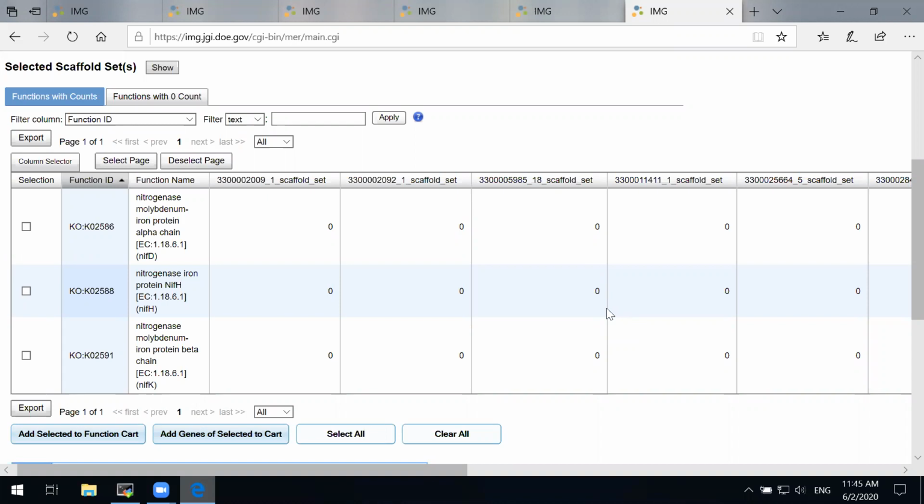It is using first the oligonucleotide composition of these contigs, because it is well established that, for multiple reasons, the oligonucleotide composition of the genome is relatively consistent. The second parameter that metagenome binning is using is read depth, or the coverage of these contigs. Again, the contigs that are coming from the same genome are expected to have approximately the same coverage. So these are the two parameters.